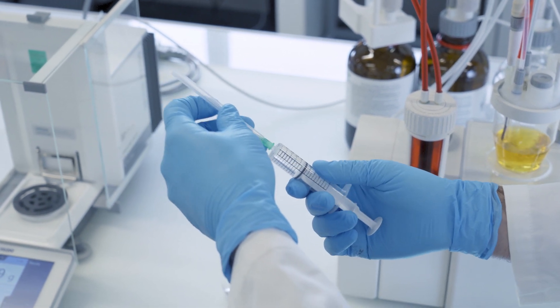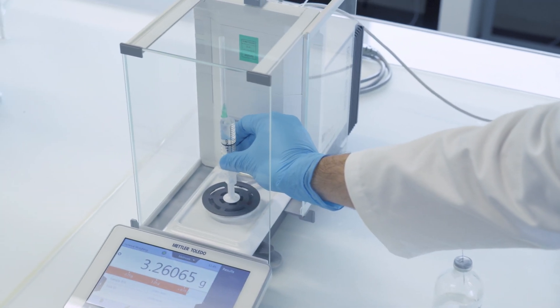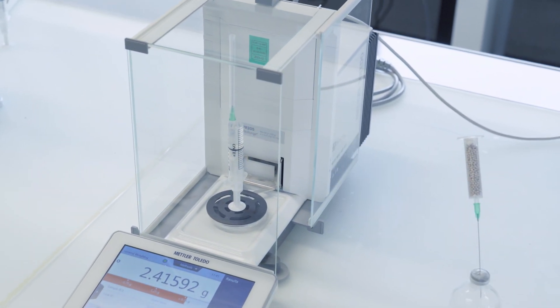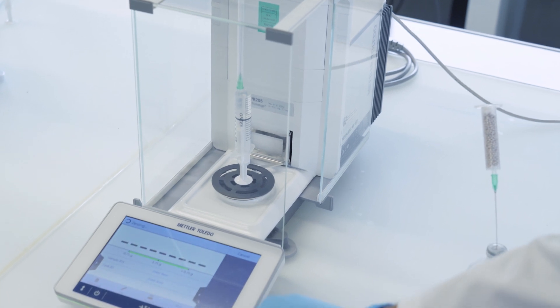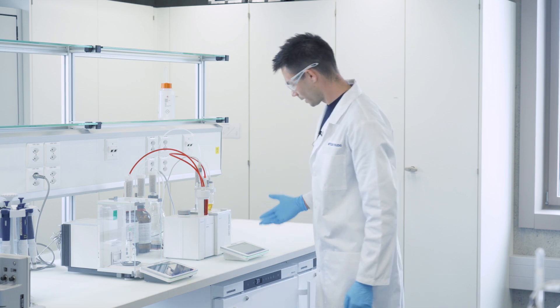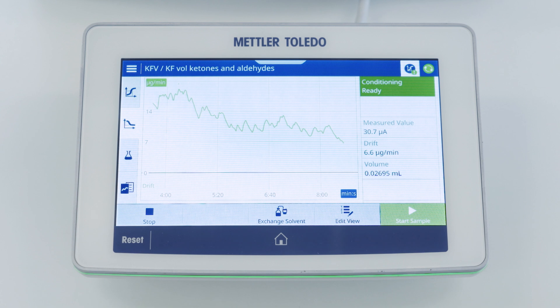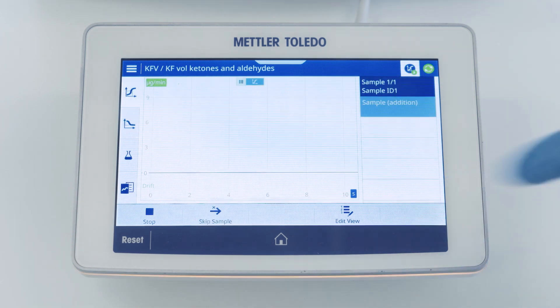Now we can place the needle on the balance and set the balance to zero. After we have zeroed the balance we check if the drift condition is still fulfilled, which is the case, and we can start the sample.